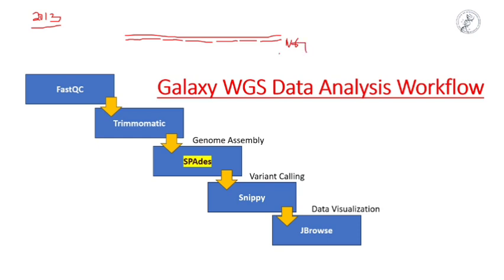Okay. This is how we do it with our sequence. If we do not have a reference genome, we will go for overlapping sequences and find out the sequence. That is called de novo assembly. Usually for de novo assembly, I am not referring to that now. How using a reference genome we will find out the whole genome, that is what I am going to explain to you.